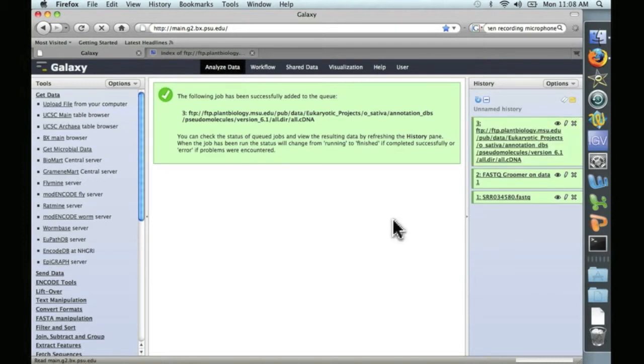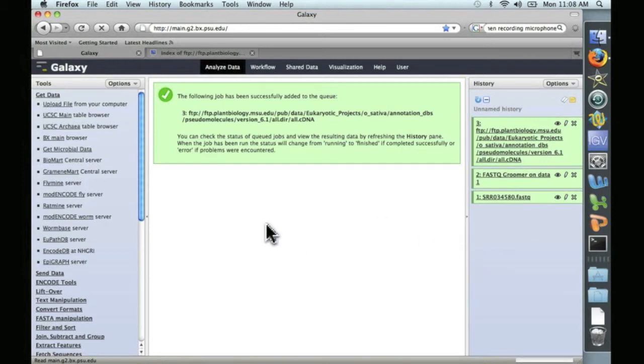And that took only a few minutes. And now we're ready for an alignment.